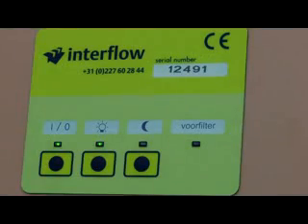What should I do when the pre-filter light comes on? Stop working! The pre-filter is contaminated up to its limit and needs to be replaced.